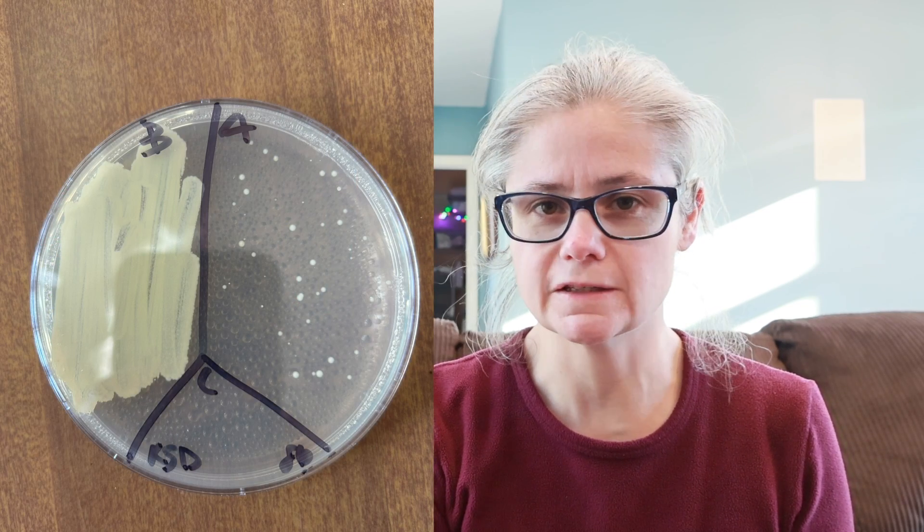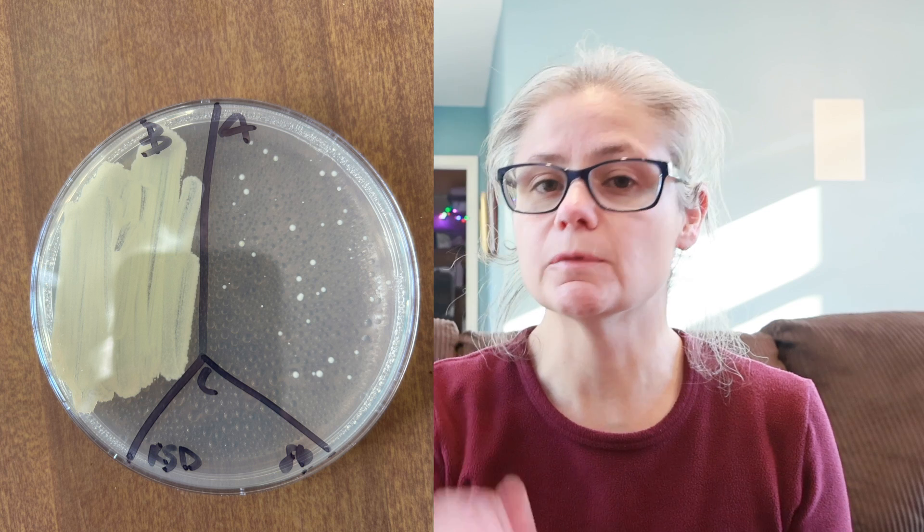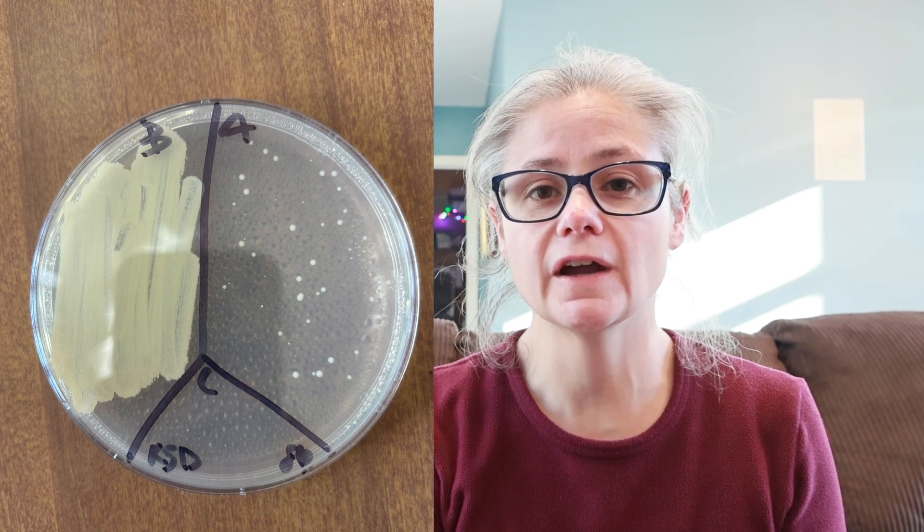The kitchen sink drain. In the before section, we can see a tremendous amount of bacteria. And in the after section, we can see a visible decrease in bacteria. We still have some bacterial colonies hanging around, but there most certainly is a visible decrease. So Mr. Clean Clean Freak did a pretty good job of removing the bacteria from my kitchen sink drain.